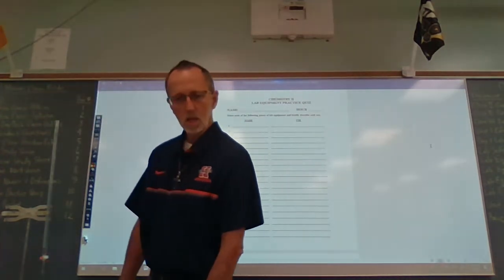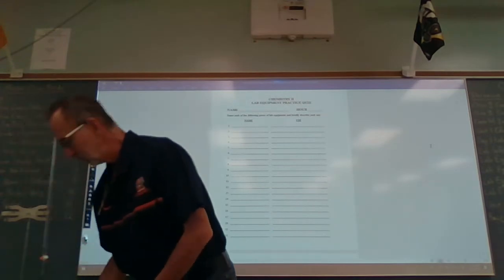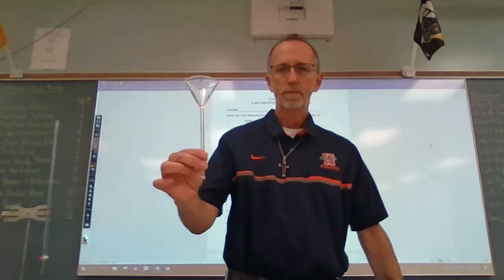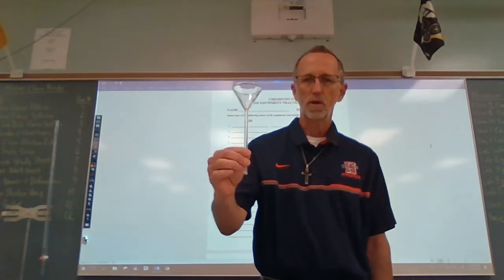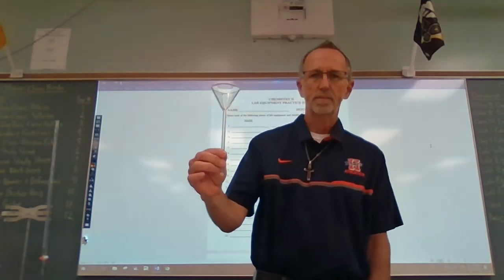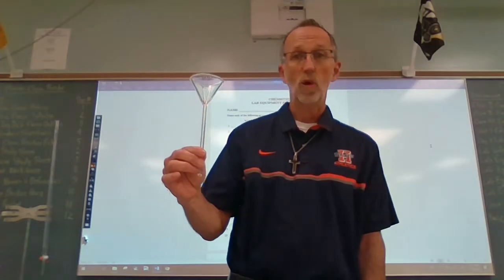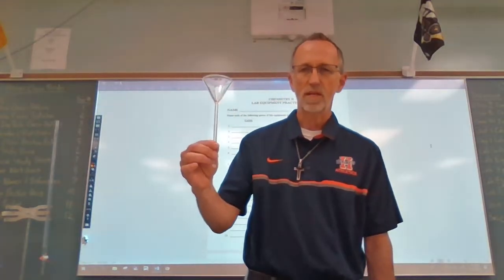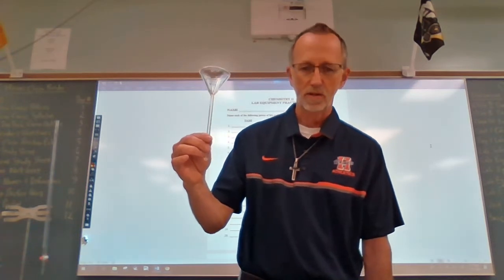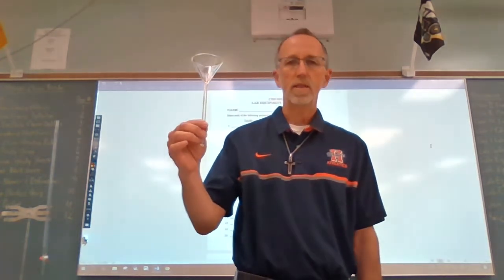So, number one. This is number one. Okay? Hopefully you would recognize that. I'm not going to spend a whole lot of time waiting on you to write down. Of course, you can pause this video while you're writing. That's perfectly okay. Anyway, number one, this is a funnel.